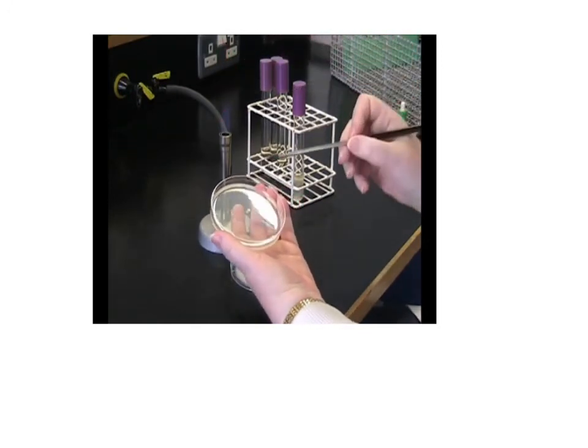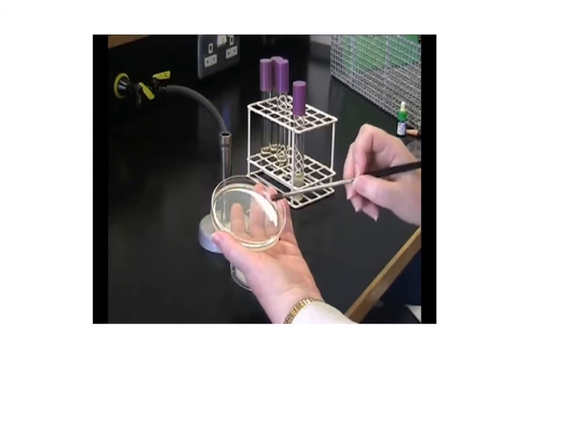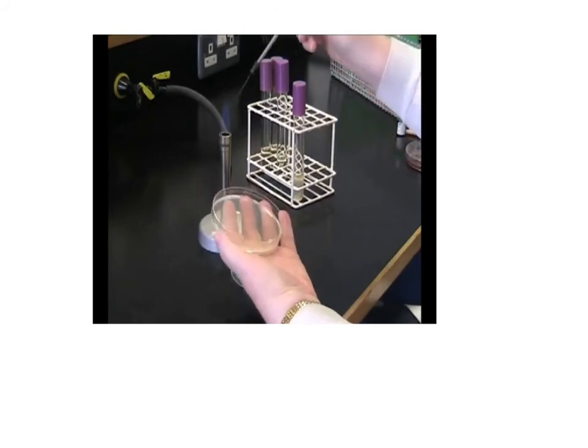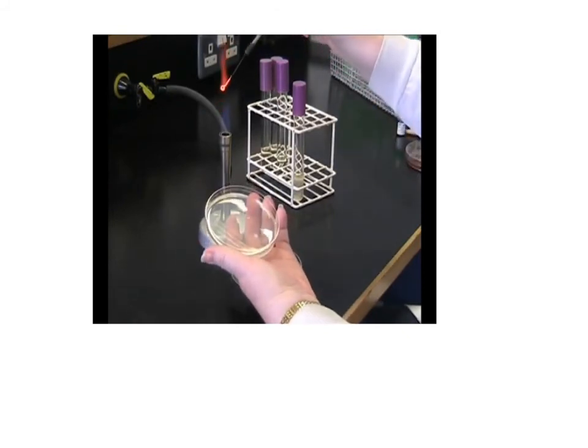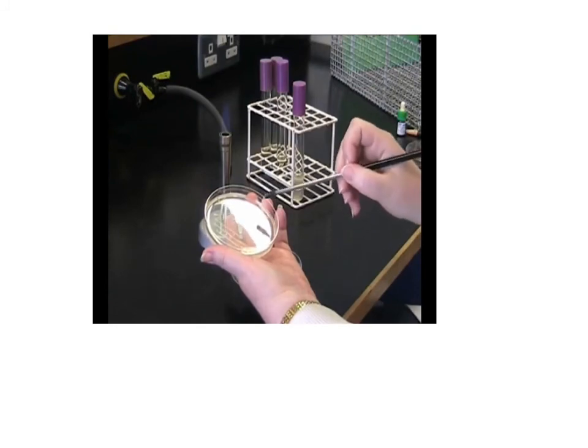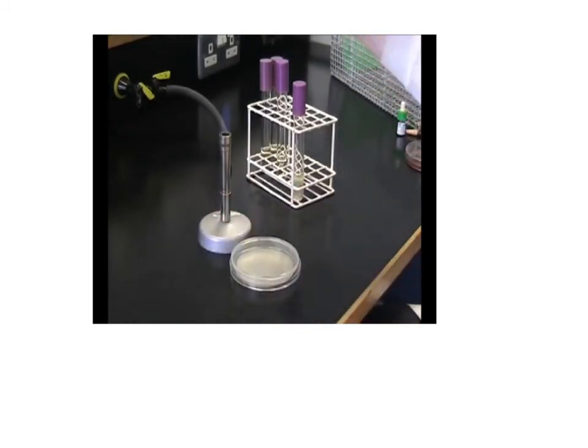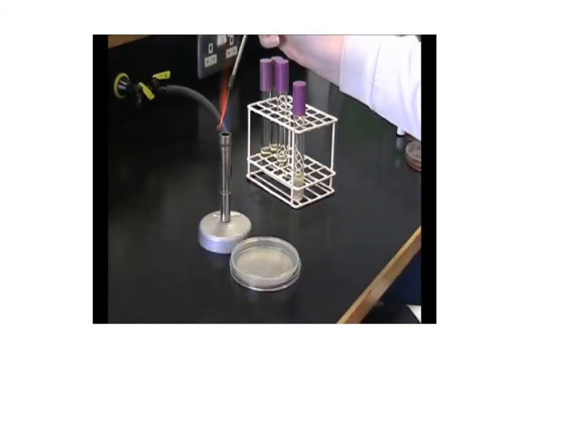Rotate the plate, cool your loop, take one streak from the primary streak across the plate. Remember to flame when you rotate the plate. Continue streaking across in order to dilute your bacteria. Always flame your loop at the end.